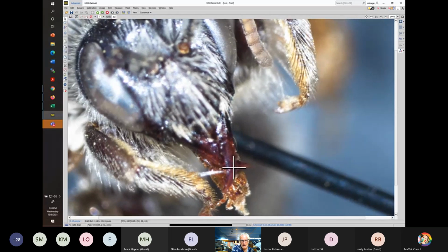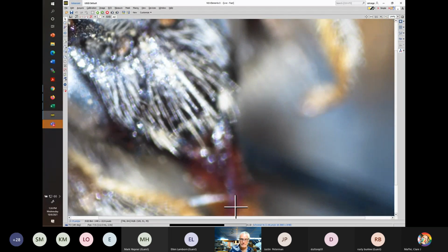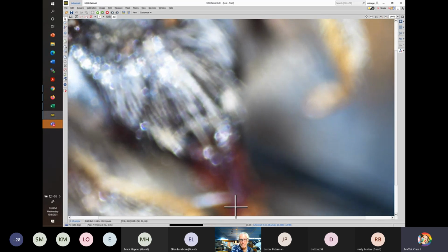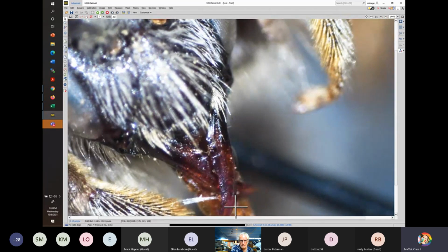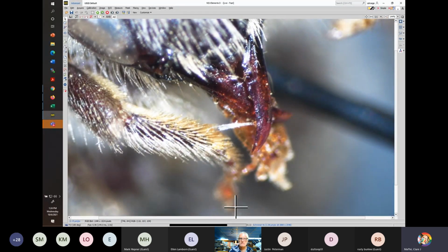The next one, I believe, is mandible teeth. If we do explore this, yes? I was wondering at some point while we have the mandibles out, if you would, at the end, zoom out a little bit so I can take a screenshot of, that's great. So I can take a screenshot of those delightful mandibles. This is only, I should point out, these are awesome mandibles, but only on Melitta melittoides. The other two have pretty much normal looking mandibles. Great, I will include that in our notes.